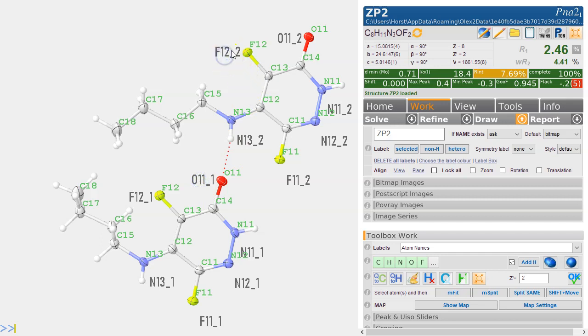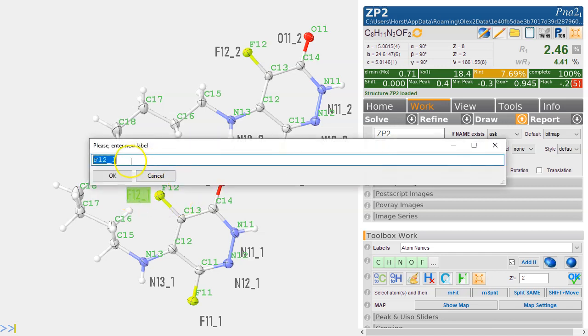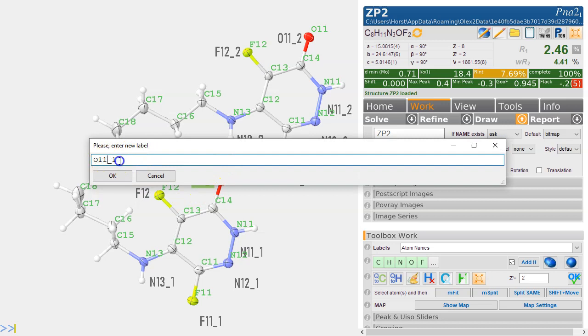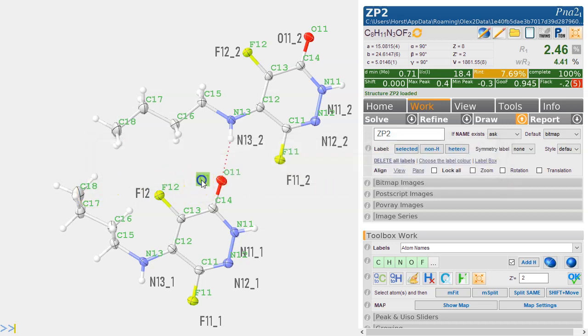If you go to the drawing area and you want to draw this, let's say you select all the hetero atoms. If you do this, you will see the underscores with it. This is automatically done here. If you didn't want these residues here everywhere, one way of doing it is double click on this and you can of course edit this label and just get rid of the residue. It's a little bit cumbersome. There is actually a way of doing this without the residue number, but I must admit I don't remember right now.